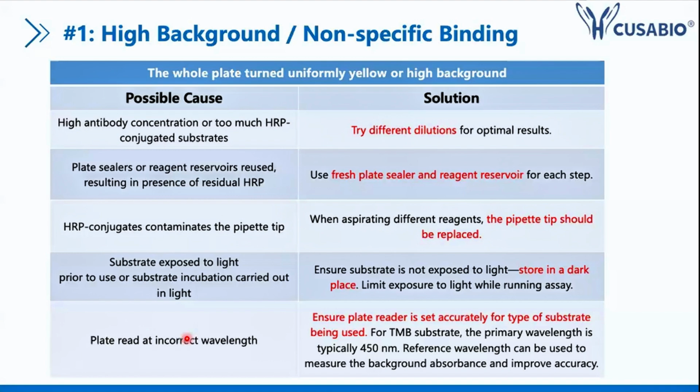Most of you are probably wondering, it's hard to distinguish which wavelength to use. In this case, my suggestion is to ask your kit supplier. I think you will get the answer from them.